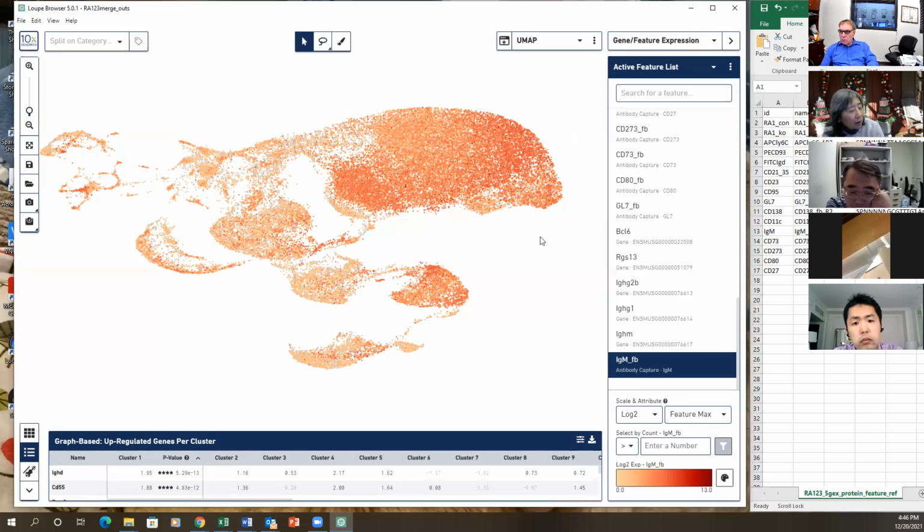And this could be light zone. It is extrafollicular germinal, extrafollicular antibody forming cell. So literature is right then. However, it's in the BXD2 mouse, that's not the main one. BXD2 mouse, maybe germinal center is still the main one.